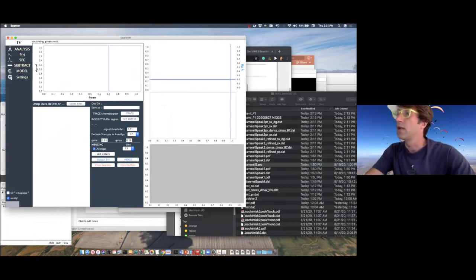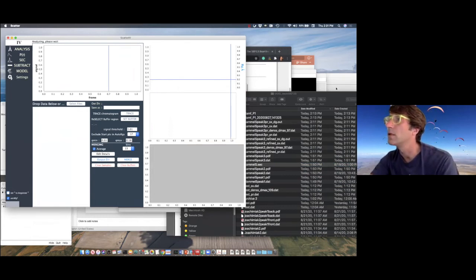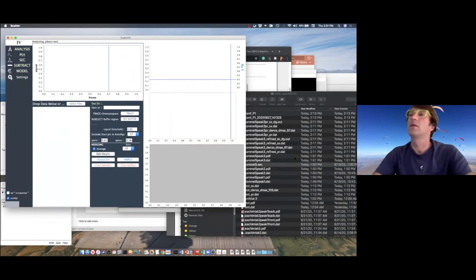Robert Rambo said the Porod volume tends to overestimate molecular weight. It's kind of the upper limit. I agree with that, but it's still a rough estimate. And comparing the VC versus MoW, it's a good case. Maybe we calculate the molecular weight in ScÅtter. Okay, so how to calculate the molecular weight in ScÅtter?